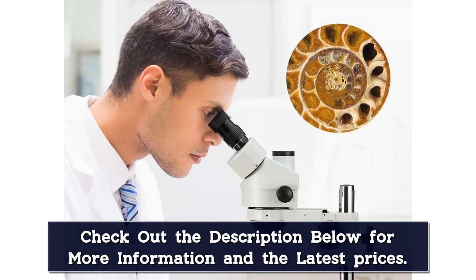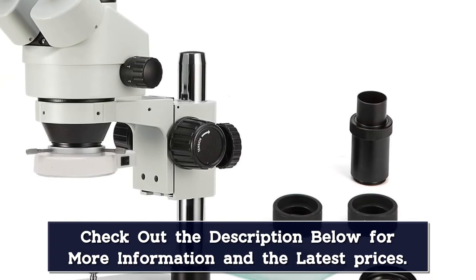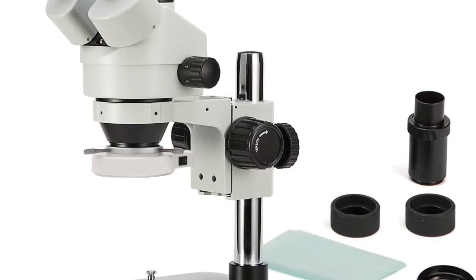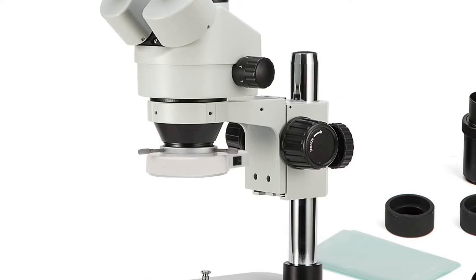Includes a powerful 56-bulb LED ring light to flood the field of view with brilliant, shadow-free illumination cool enough for working with temperature-sensitive specimens. Rugged construction with a sturdy metal base and plain stand that allows for work with objects.